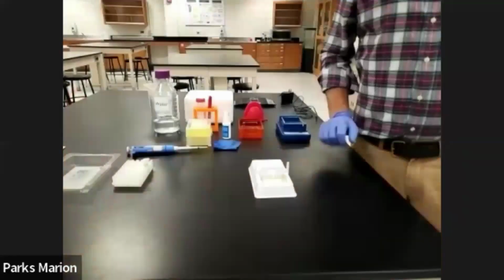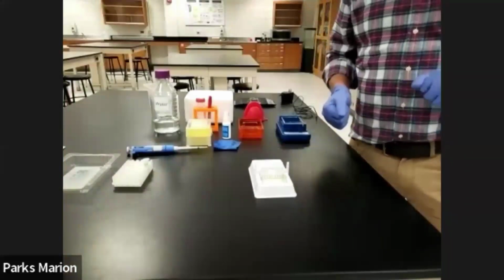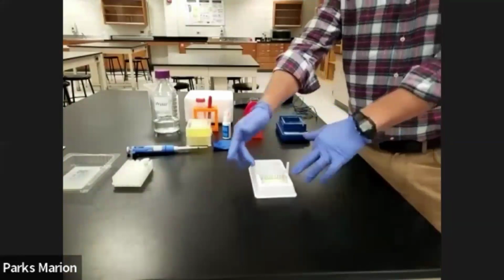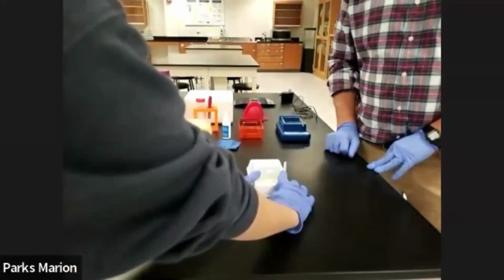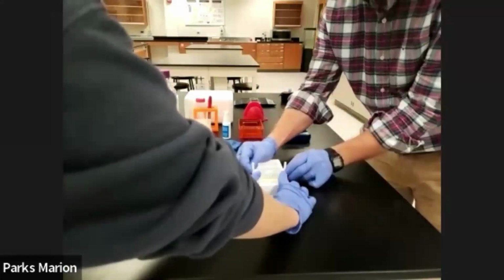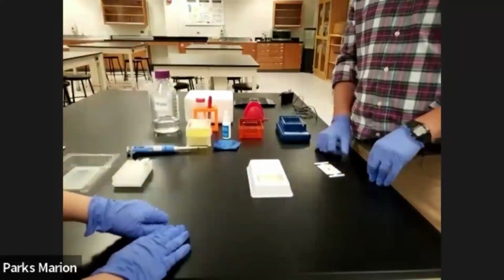All right. For the next step, you'll need to remove the comb so that the wells of the gel are open and ready for our samples to go in. To do this, you need a teammate to stabilize the tray so that the tray doesn't get removed as the comb gets removed. So I'm going to have our teammate stabilize this tray just like this, and then we're going to pull directly up on the comb, just like this, leaving those wells open.